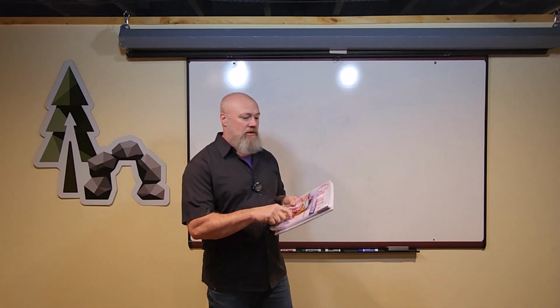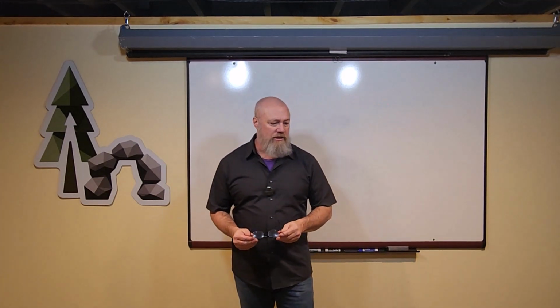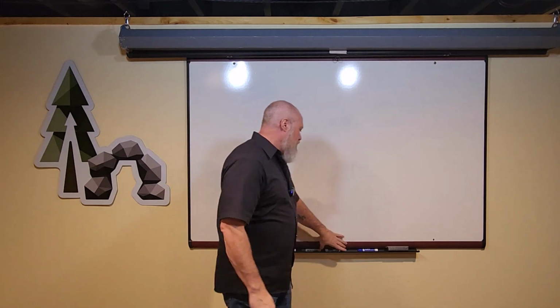This year, 2024, coming up, we're going to be using Grant's Dissector 17th edition. So make sure you get the new one. A few changes in there. We're going to follow along with the new edition. So this video is going to be to talk about the things you'd need to do a more formal study of the anatomy of the human body.